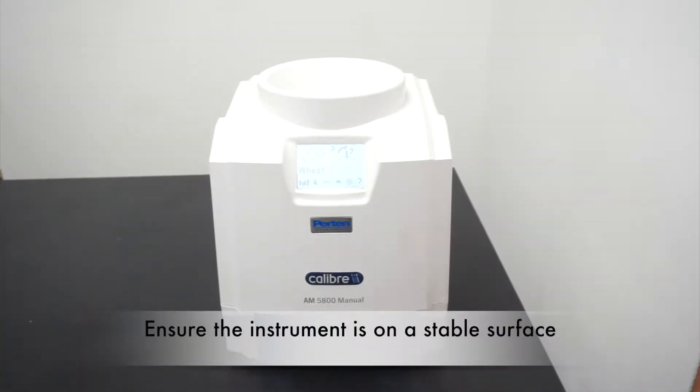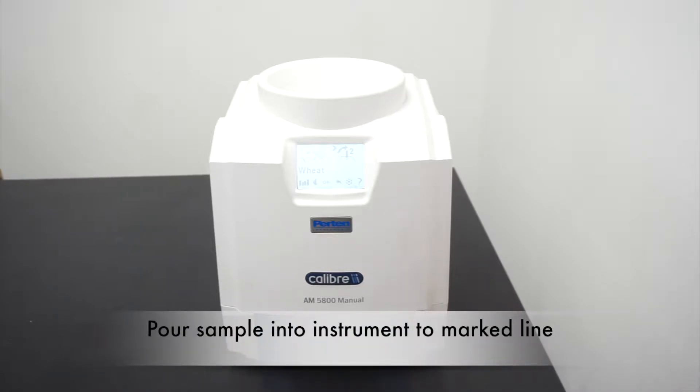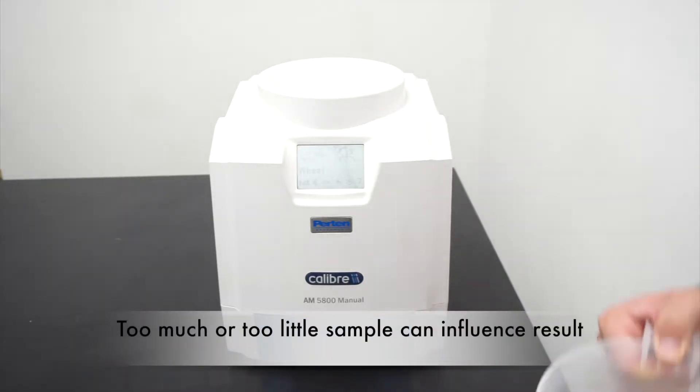Ensure your instrument is on a stable level surface and the correct commodity is displayed on the screen. With the handle in position one, pour your sample into the instrument ensuring there is enough to reach the marked line. Too much or too little sample could affect the moisture result.